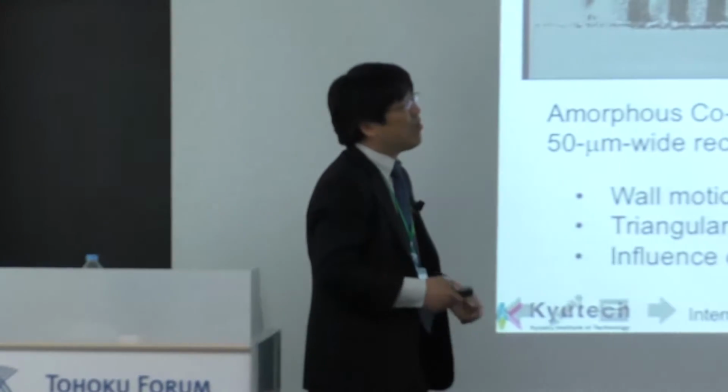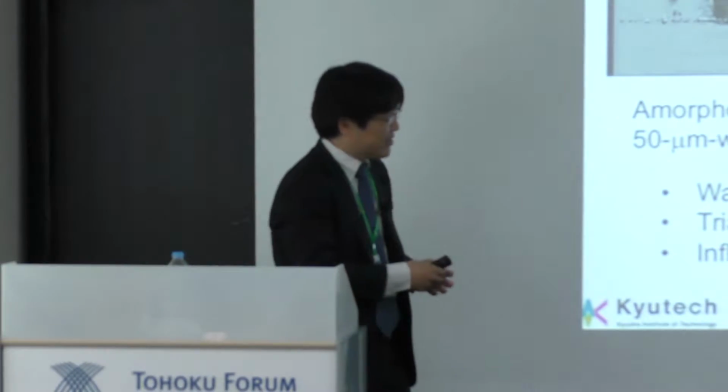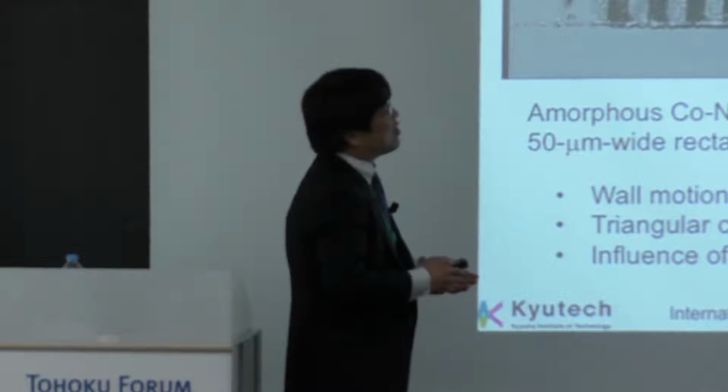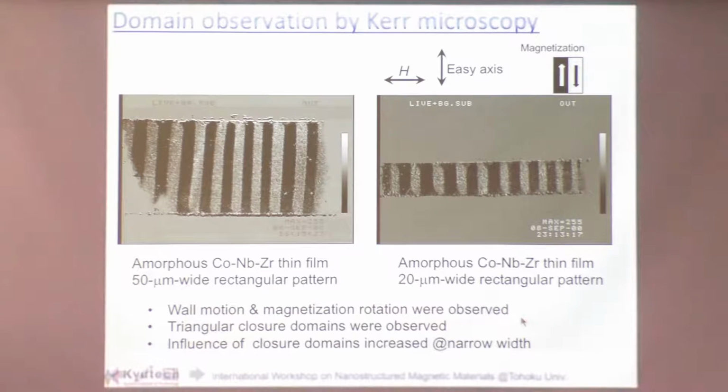And in this case, it's the 20 micron wide sample. Wall motion and magnetization rotation also occurred, but you can see the triangular closure domain during the magnetization process.